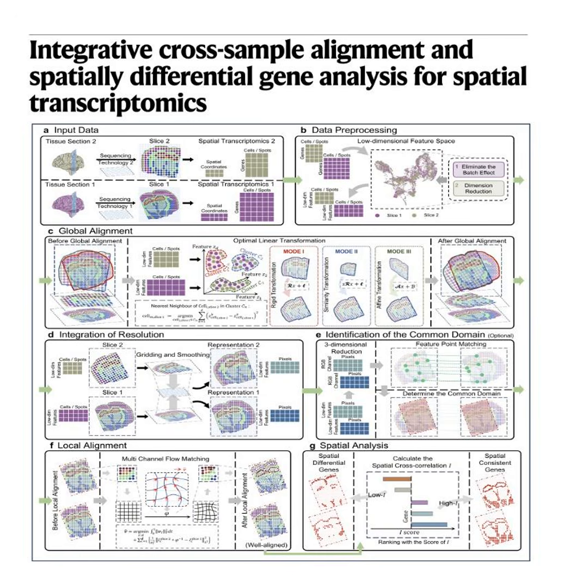Because the older tools only saw that the total volume of CCL2 was the same, they totally missed the emergency response. Exactly. Finding an SDG isn't about counting, it's about mapping behavior. So a quick recap of the second section for you. CODA finds hidden disease markers by hunting for SDGs, genes that physically move to new locations in a diseased state, even if their total numbers stay the same. It catches the police officers swarming the broken bridge.